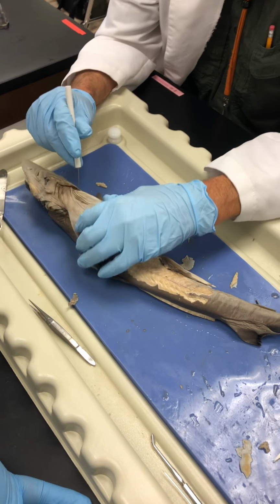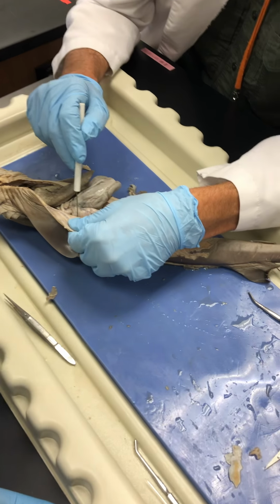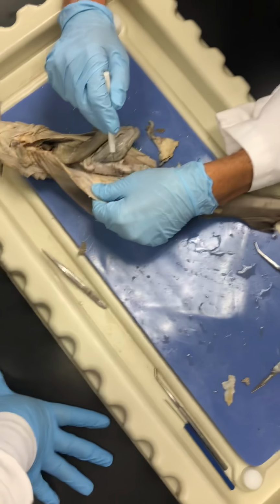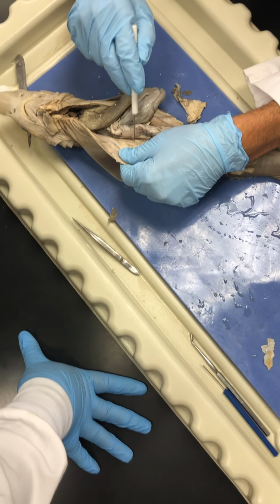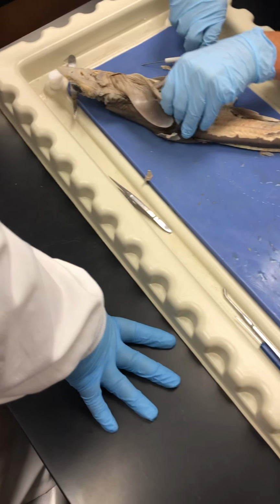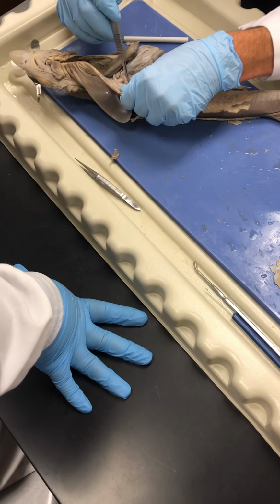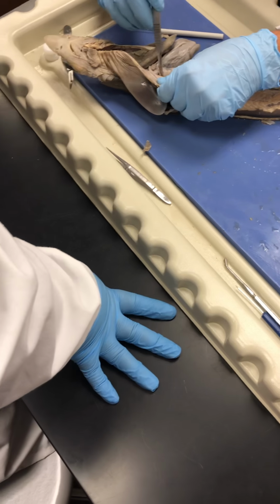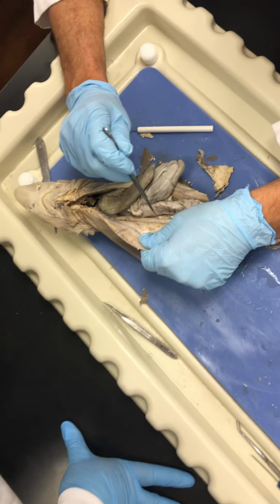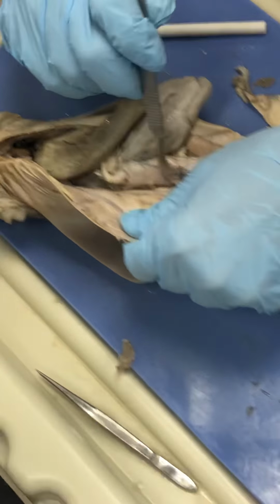Okay, now, continuing on. What's this right here? Right there. It's on both sides, right there and right there. Actually, we need to cut that a little bit more. No, it's the kidneys. See this part between here and there? Okay, that's the kidneys. Now you need to cut it and expose it a little bit more. But that's the kidney there, and that's the kidney there on the other side.